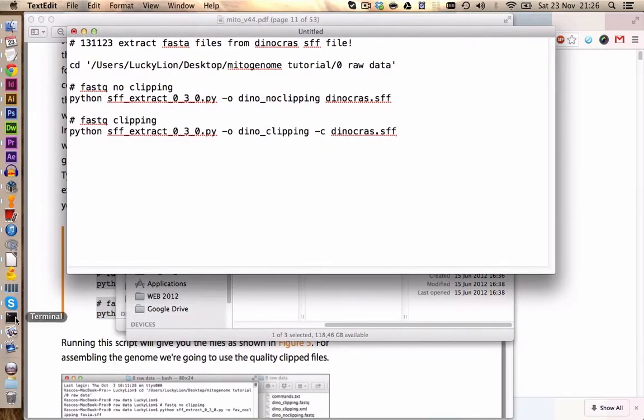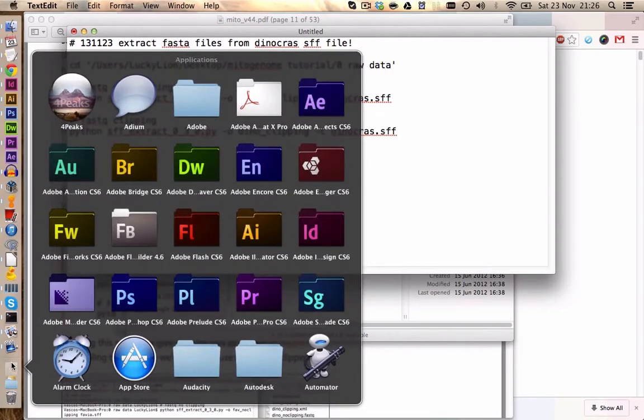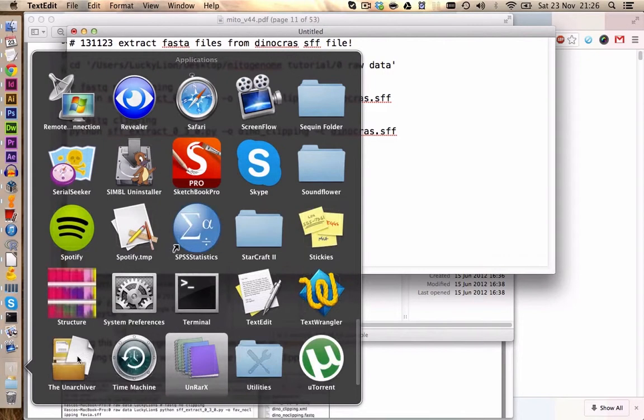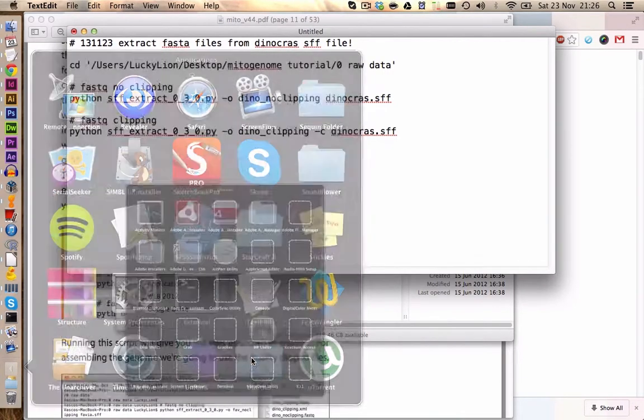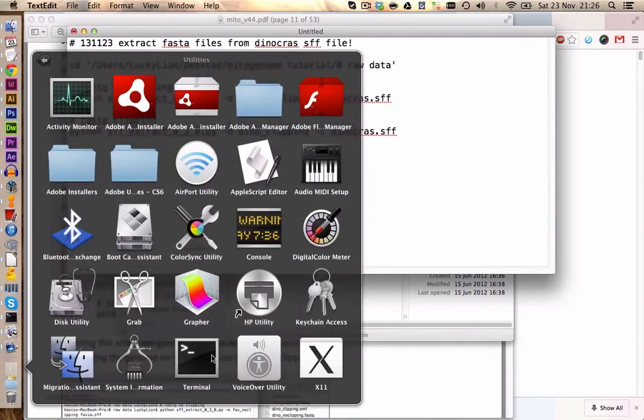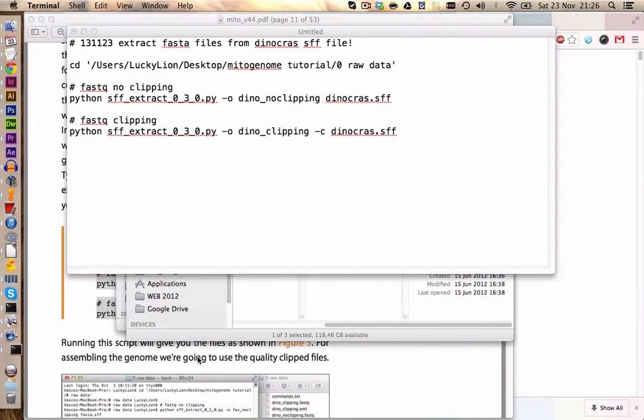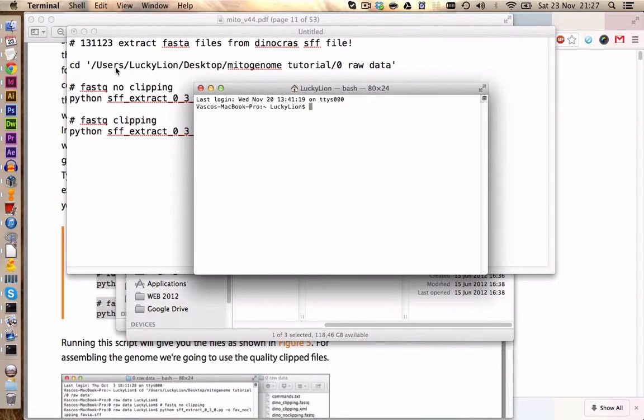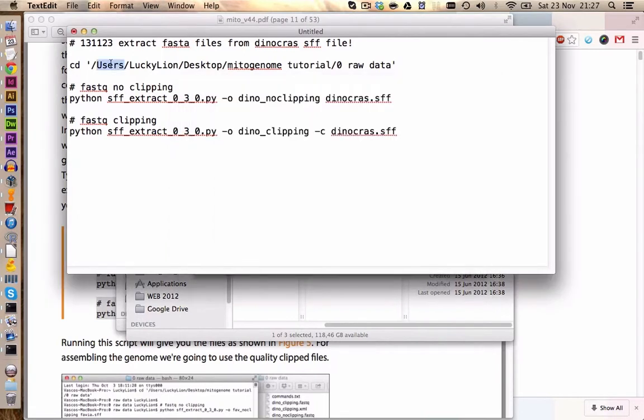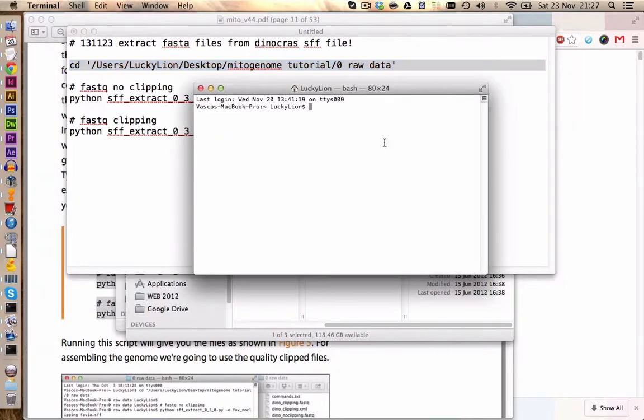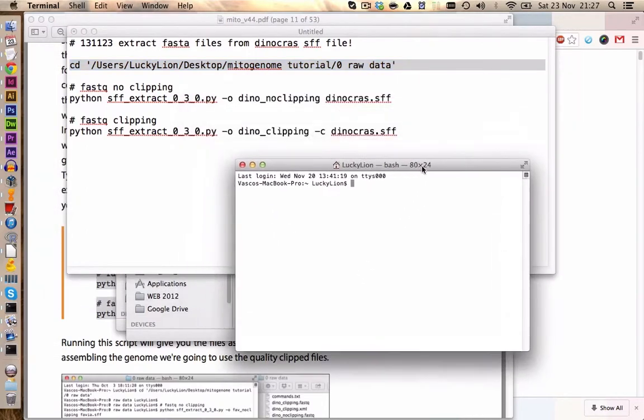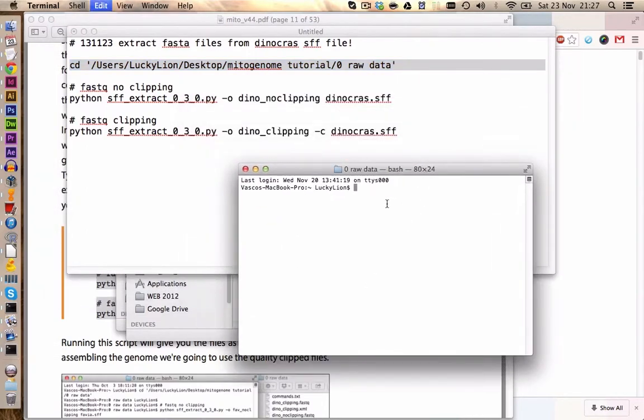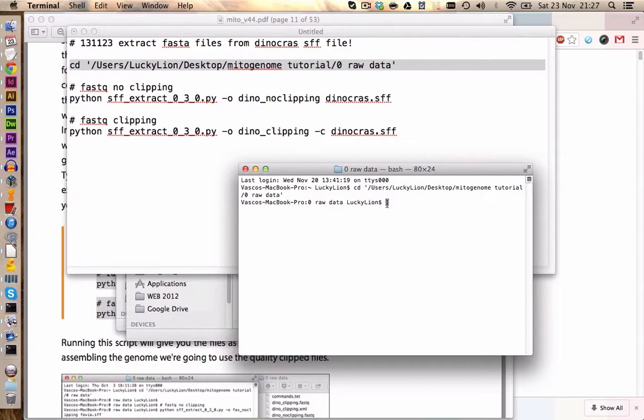Now we can basically run this thing. If you don't have your terminal in your bar over here you can click on Applications and normally under Utilities you will find your terminal. Click on it to start it and then we are simply going to copy the things we have written in here into the terminal. Let's start with this one here. This will change the working directory. So if I type now ls I can check if I am in the right folder. So I have here my Dinocross SFF and also the script.